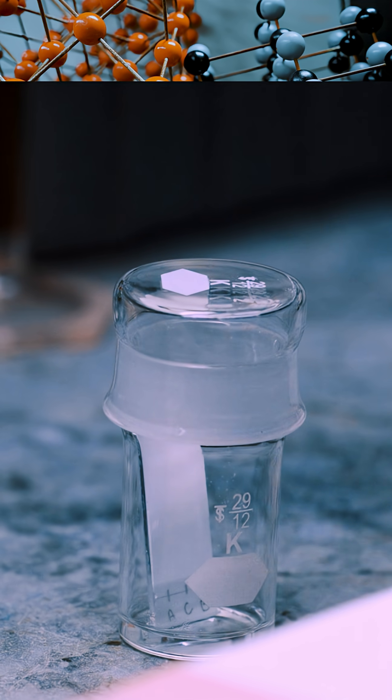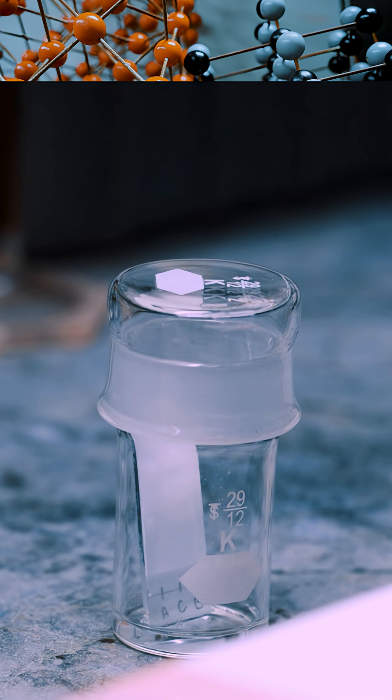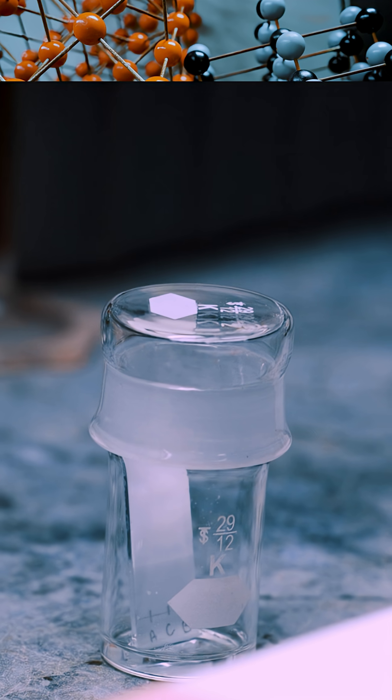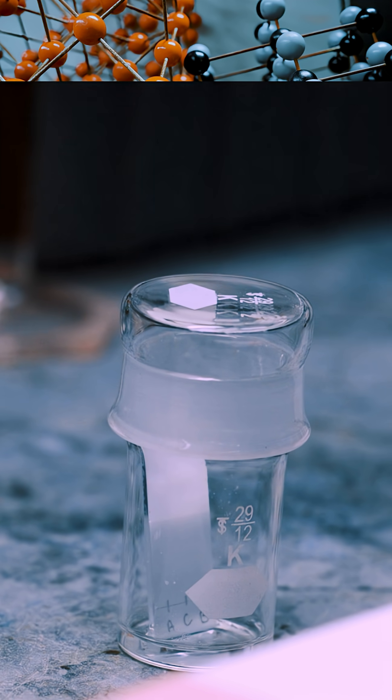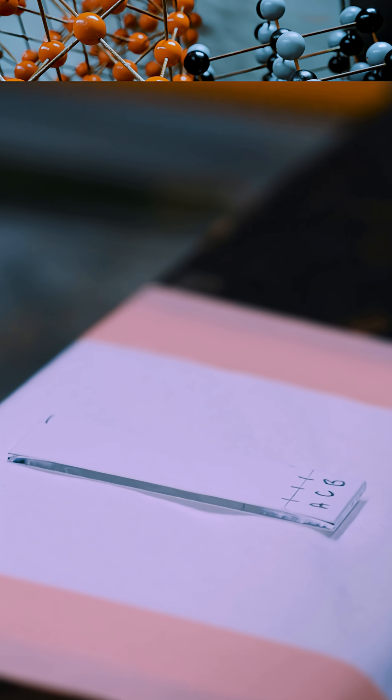The chemicals that we've added here are basically sticking to this and we call that the stationary phase. Those molecules have a choice. They can stay on that stationary phase and they will stay on it. But the solvent, which we call the mobile phase, will start moving up this plate and then the chemicals will move with it.